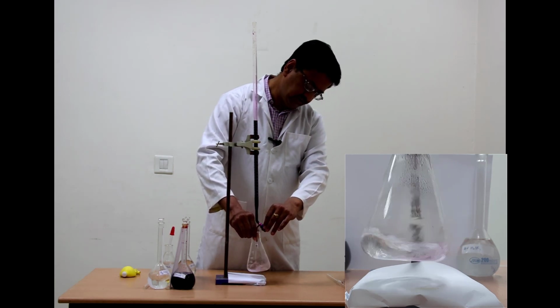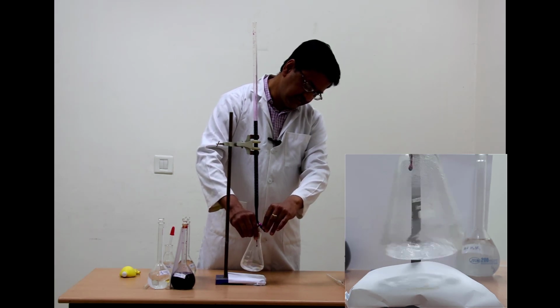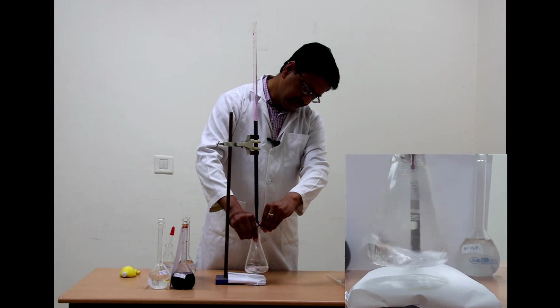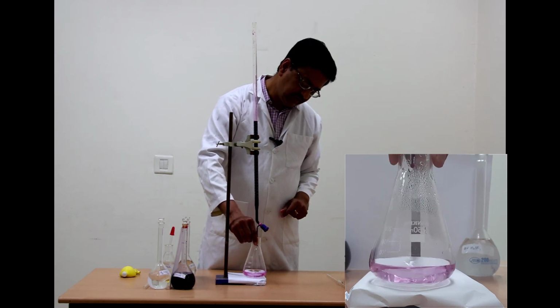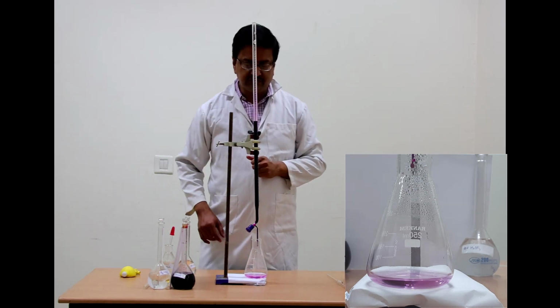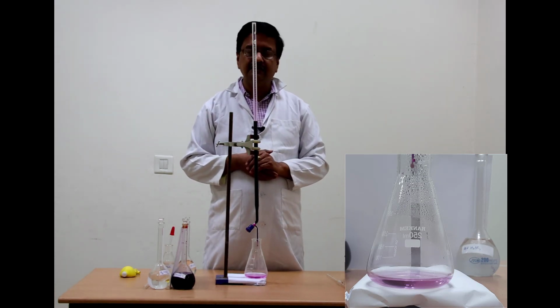Now you can see that we have come very close to the end point. So at this point again, the decolorization takes a few seconds. It does not happen immediately, it takes a couple of seconds and it tends to stay for longer, and I am sure in the next drop this color will come and will not disappear even in 30 seconds. So this is the end point that I have shown you in the previous titration also, and here the end point has been reached. And this burette reading is 24.1 ml. That means we started from 12 ml and this time it has consumed 0.1 ml extra, which is of course an acceptable variation in a titration.